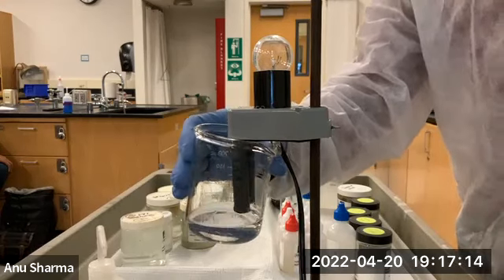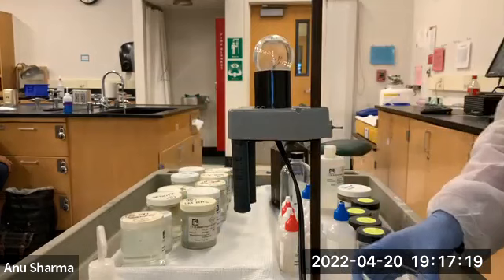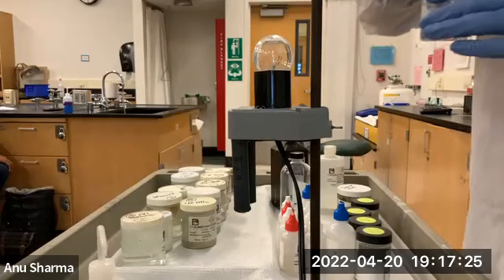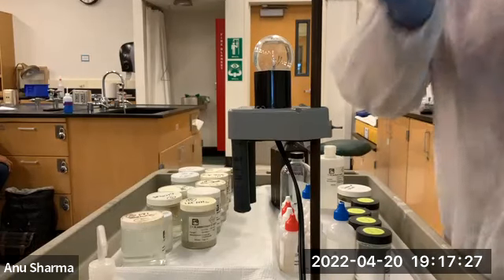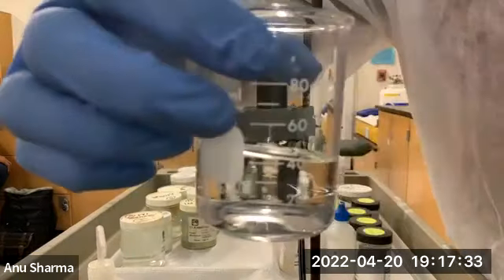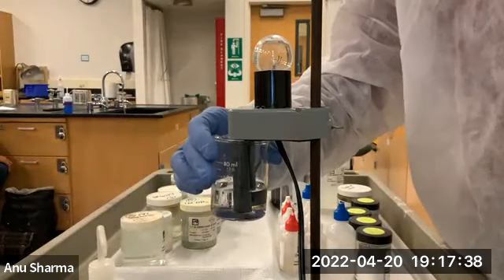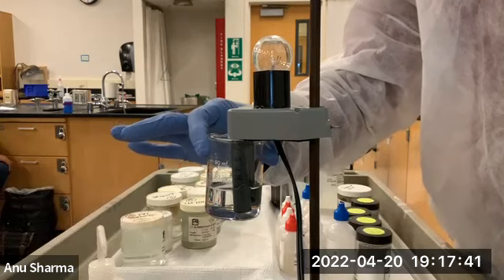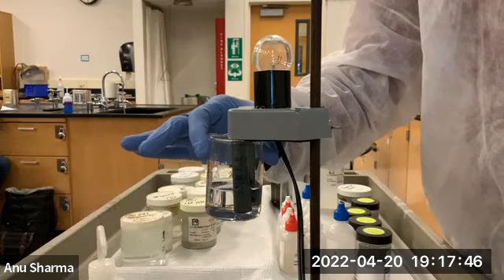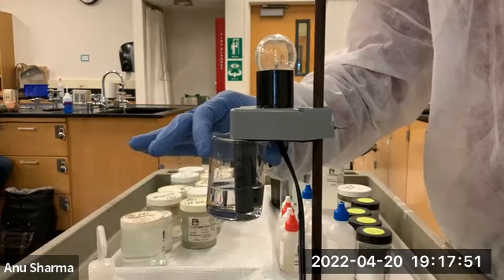The OH is not released as an ion. So this is a nice clear solution of C2H5OH with water, but it does not conduct electricity, because the OH is in hydrogen bonding with water, and OH is also covalently bonded to C2H5OH.